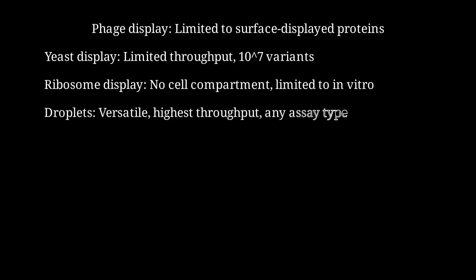Droplets are the most versatile. They achieve the highest throughput and can accommodate almost any type of assay: enzymatic, binding, whole cell metabolism, or growth selection.